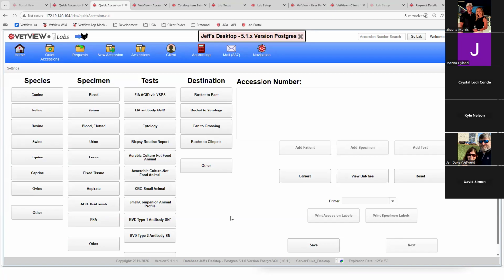We're looking at doing a batch entry screen, a herd-based screen, a different concept where I can say I've got 20 animals, 20 tests, go, and have it build it out quicker. That's something we're looking at in the future, but that's just another option in the system.